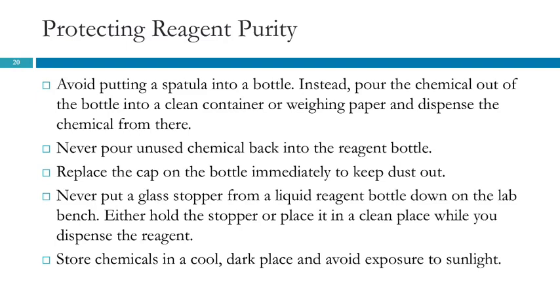And so that's one of the things that makes me crazy. Chem 1A, just ripping on them. I go over there, and there's like 3 reagent bottles with the lids off and spatulas sticking in them. I mean, that's just so wrong on so many levels. You put the cap back on. Some of those things are hygroscopic, and so they're going to absorb moisture from the air, and then they're going to cake up and get hard. And some of them, you get dust or other impurities falling into them.